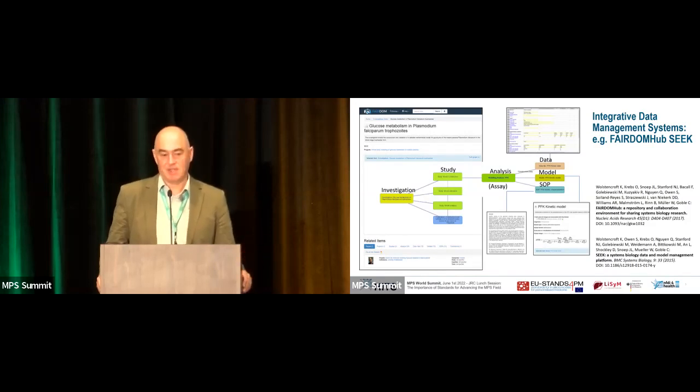At HITS, we developed the Seek platform over the last 15 years, actually, in the context of the FAIRDom initiative. And there we have established a platform that is used by many consortia in Europe, but also worldwide and locally used for data management to actually structure data models, SOPs, so standard operating procedures, and other information on the assays.